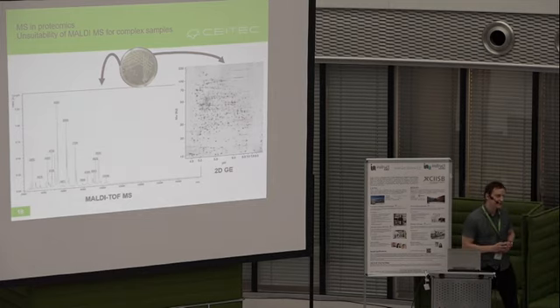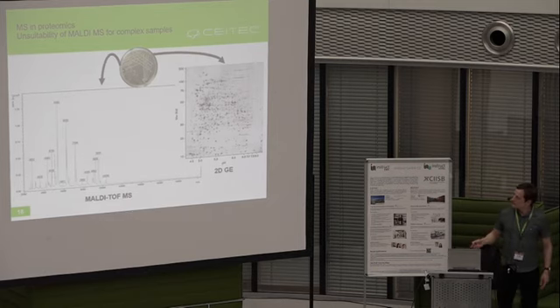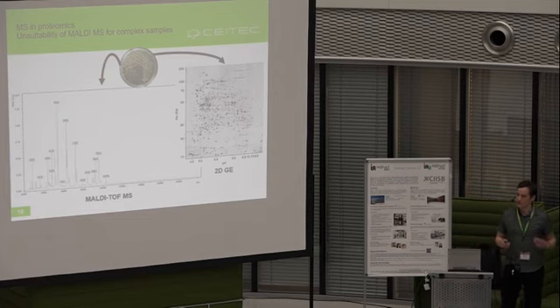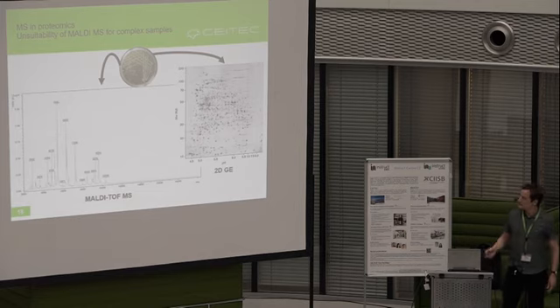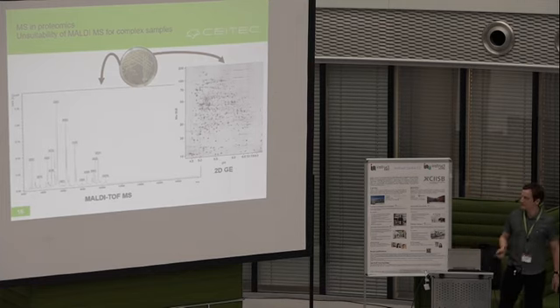Due to signal suppression effects, only the most abundant, the low molecular weight and basic proteins can be detected directly from complex protein mixtures. If your protein of interest doesn't fulfill those criteria, it will simply not be detected. And usually all abundant proteins have been discovered and no one is interested in them.